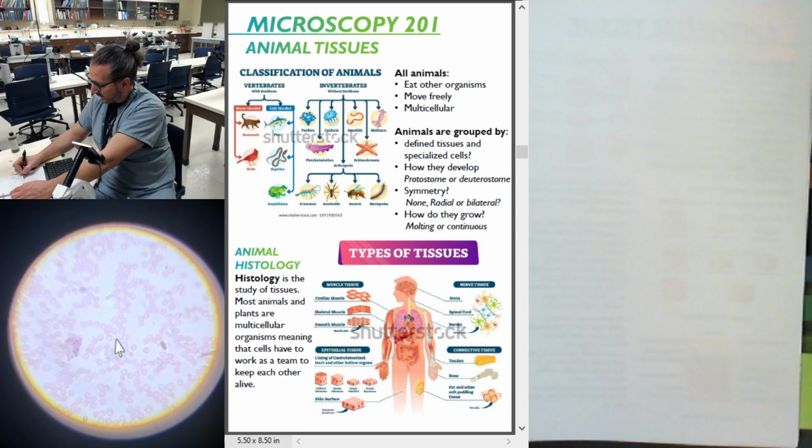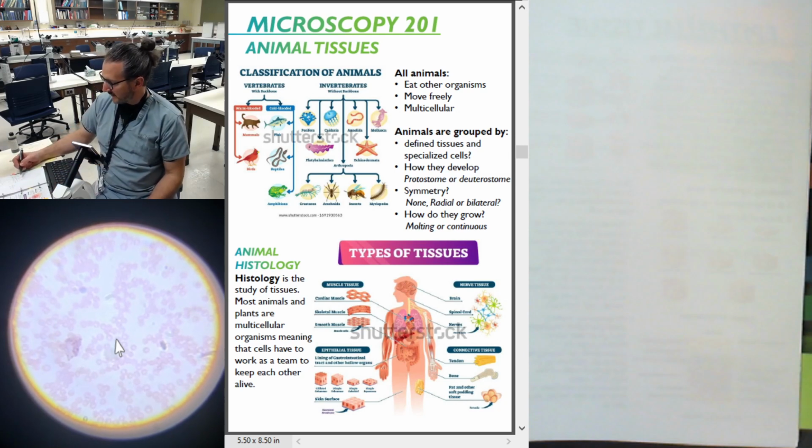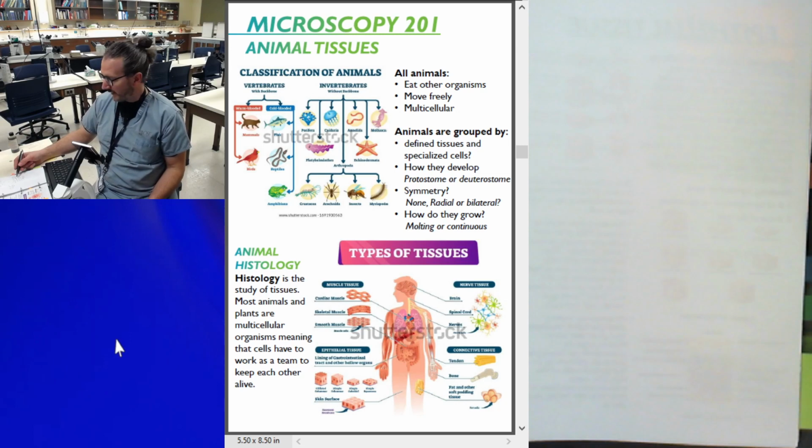They're about, this little squiggly means about 7 microns. And micron's written really weird. It looks like the letter U, with a kind of long leg, and micron. Why is that important? There aren't a lot of cells I'll tell you the size of, but this is important because it's actually a measuring stick. So if I know that one of these is 7 microns and I'm looking at something that has 10 of these across, it's 10 wide, that's like putting 10 little rulers up against it. I know that whatever these 10 things are in is 70 microns wide. So it's really important. Right, so that's red blood cells.